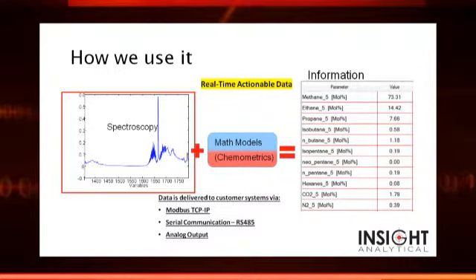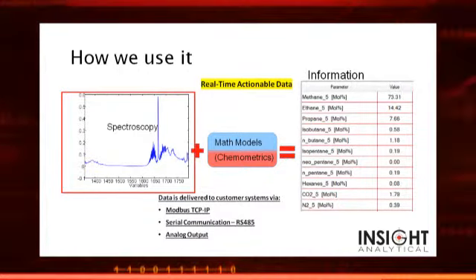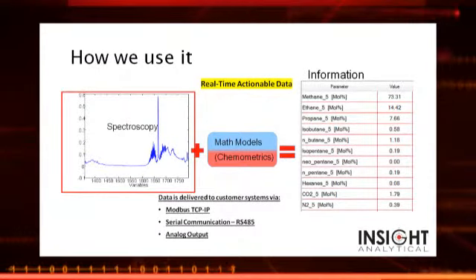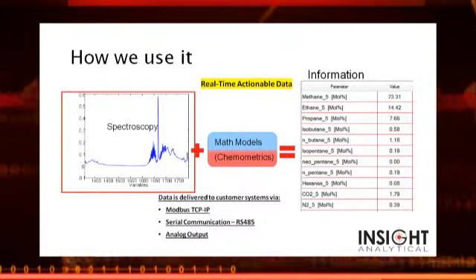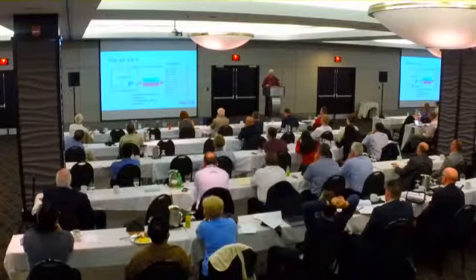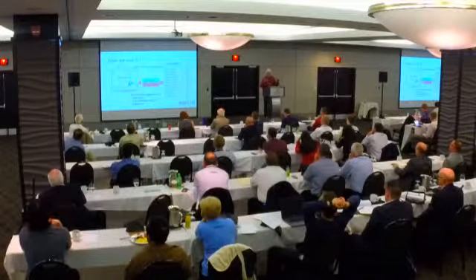In this case, this happens to be a rich natural gas sample, so this is nat gas. And we do this analysis, we shoot the beam of light through, and down here we get a complete analysis of the chemical composition. Methane, ethane, propane, N-butane, I-butane, C5 splits, C6s. We can take this out to C9s. So that's one piece of this puzzle, right?